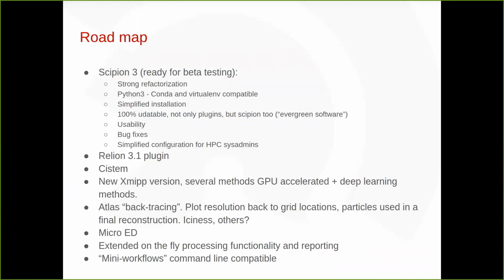MicroED is coming as a side project. We are not working on this, but the Scipion, because of its architecture, is able to work with all the domain data. And there's actually a developer in Sweden working on a version of the Scipion for micro electron diffraction. And there will come some other on-the-fly processing functionality and reporting. We've been working on this to improve that part.